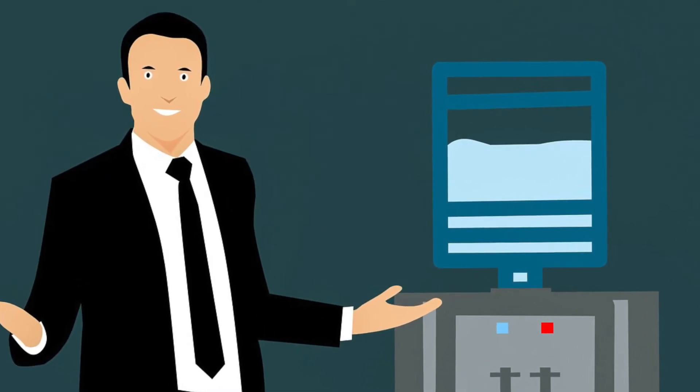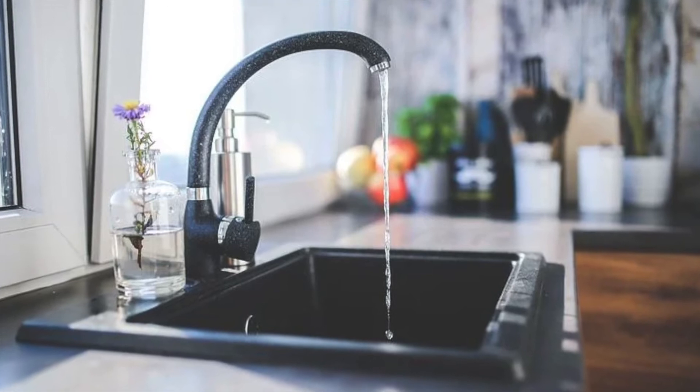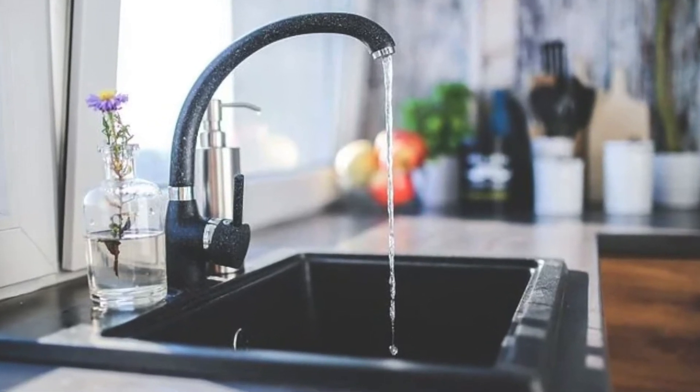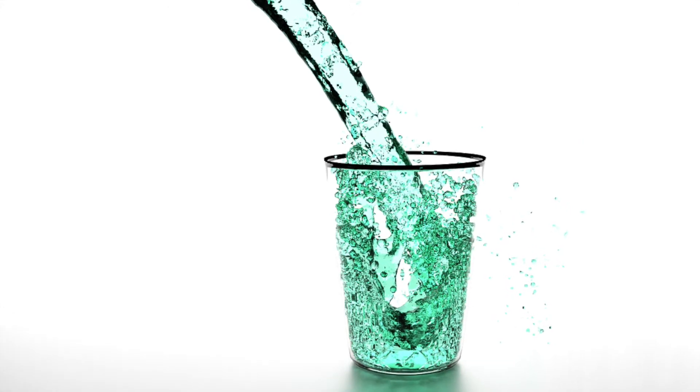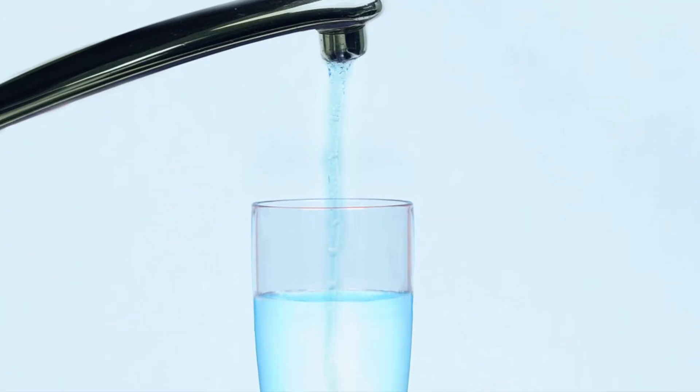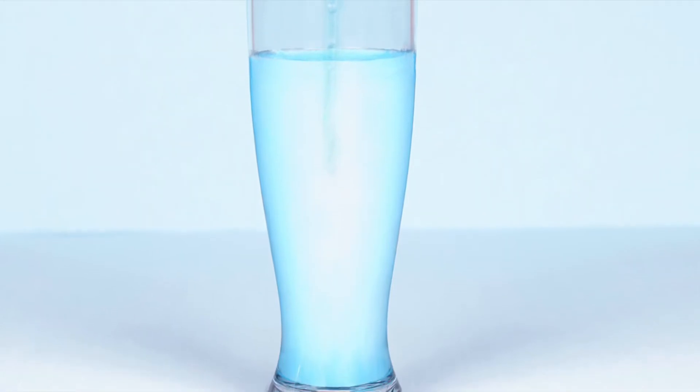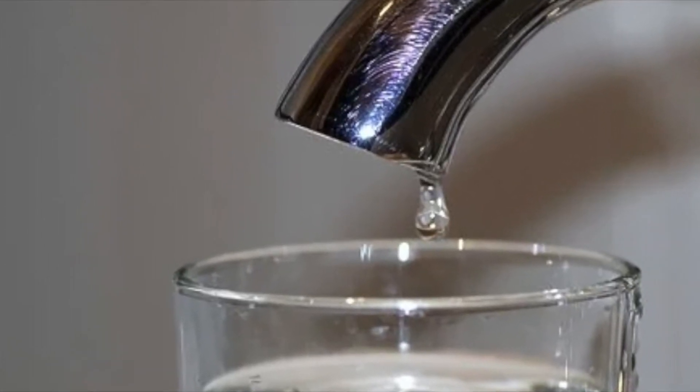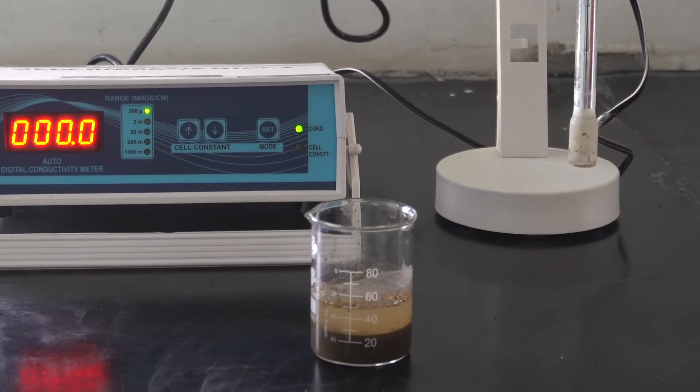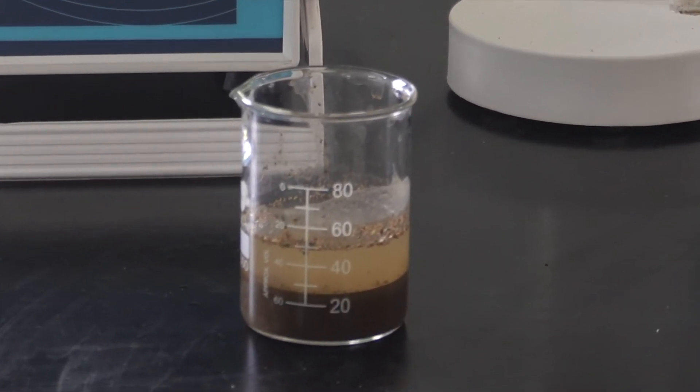Pure water does not conduct electricity, but most water, even tap water has enough dissolved salts to be conductive. Because the concentration of salts in water directly affects its conductivity, the measurement of electrical conductivity is a very effective way of measuring salt concentrations in soil water.